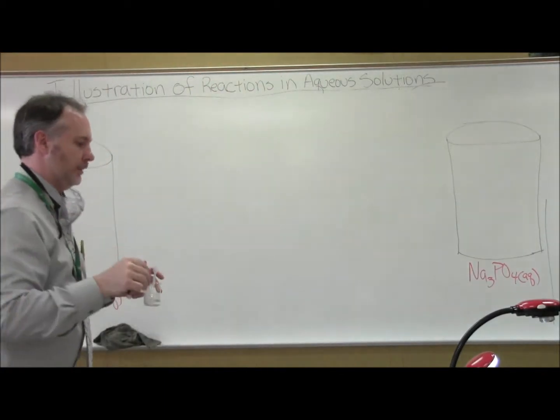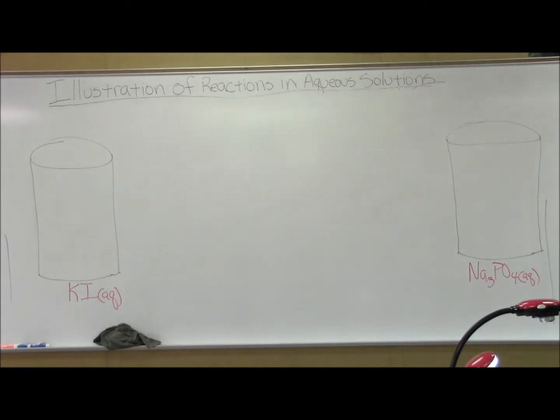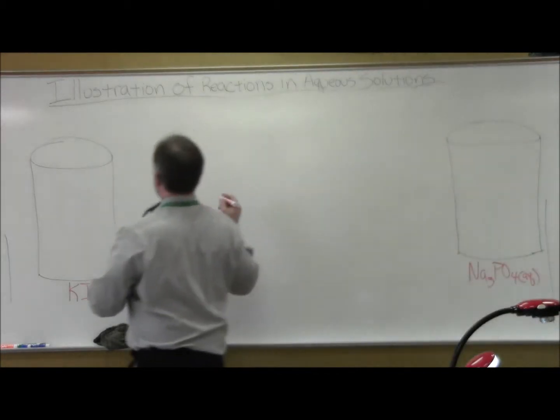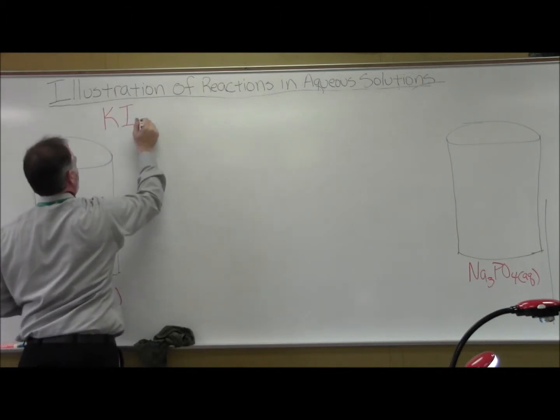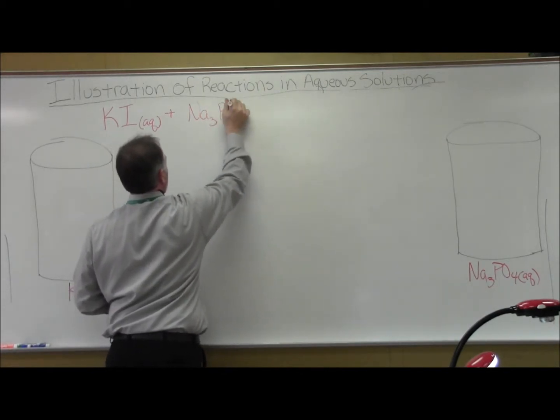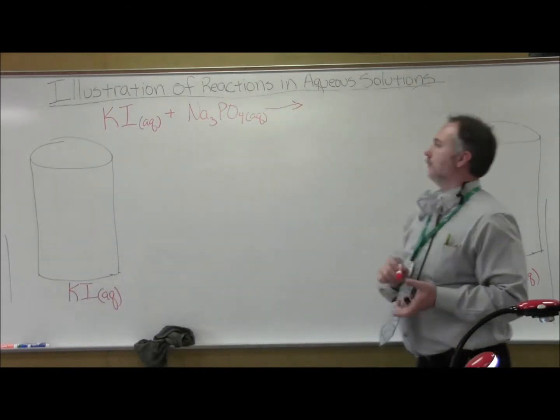These two will be mixing together to see what happens. So there's our two reactants.